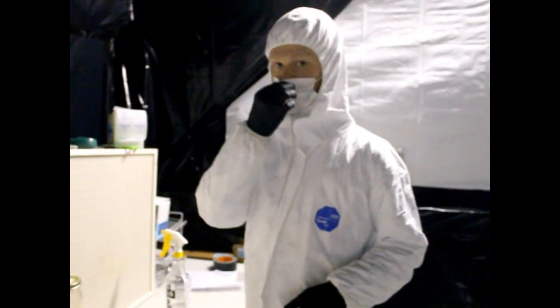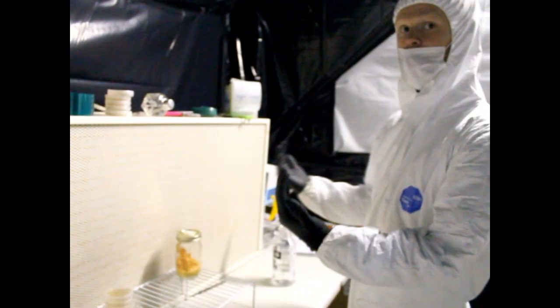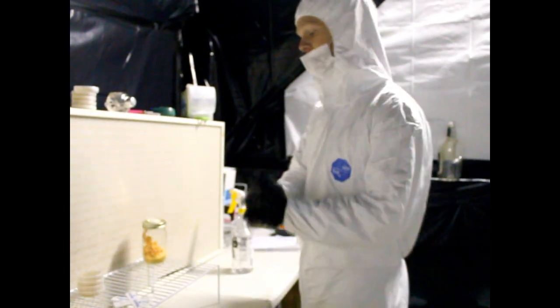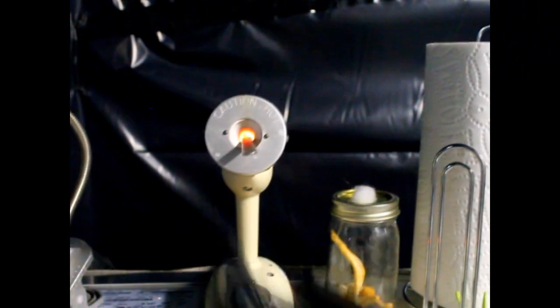Obviously we're wearing these Tyvek suits, face masks, and gloves. We're working in front of a HEPA filter — everything is sterile, it's clean. We spray down our hands with alcohol to kill bacteria, and our tools are stainless steel, which we can sterilize in here using a facto incinerator.